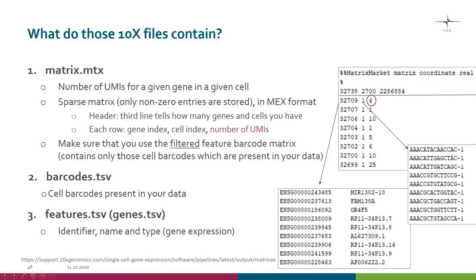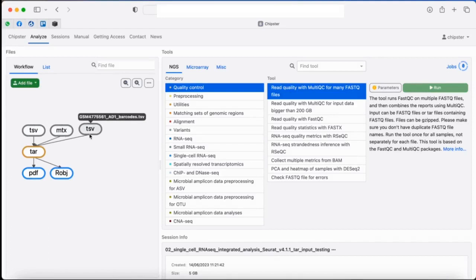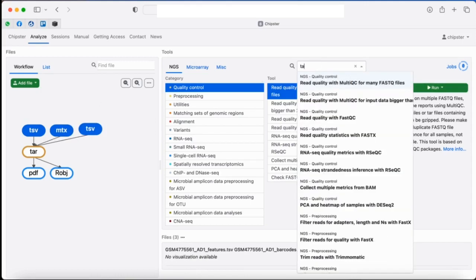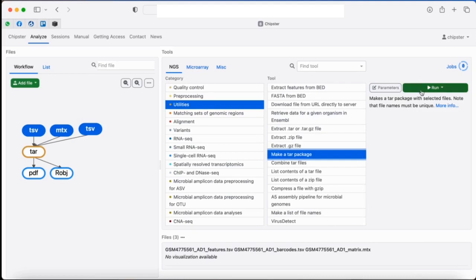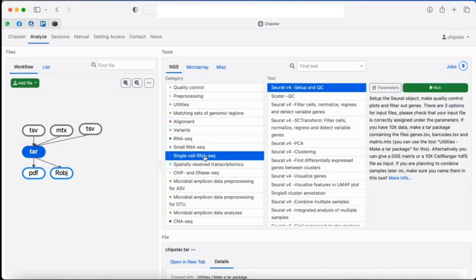It's important to remember that you will get two folders, and you need to take the one with filtered barcodes rather than raw barcodes. Filtered means we only have those cell barcodes actually present in your data, otherwise you end up with an enormous matrix with all possible barcodes. Here we have imported the three 10x Genomics output files into Chipster. In Chipster you can select these files, use the make-a-TAR-package tool, and use that TAR package as input for the setup tool.